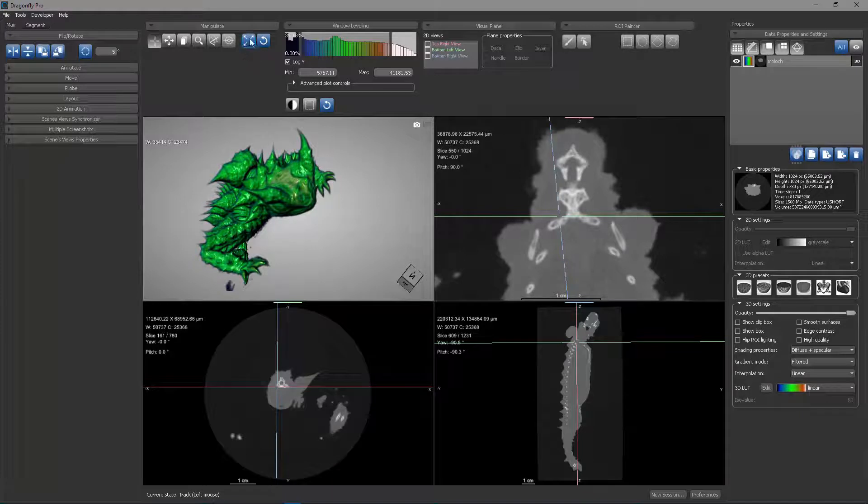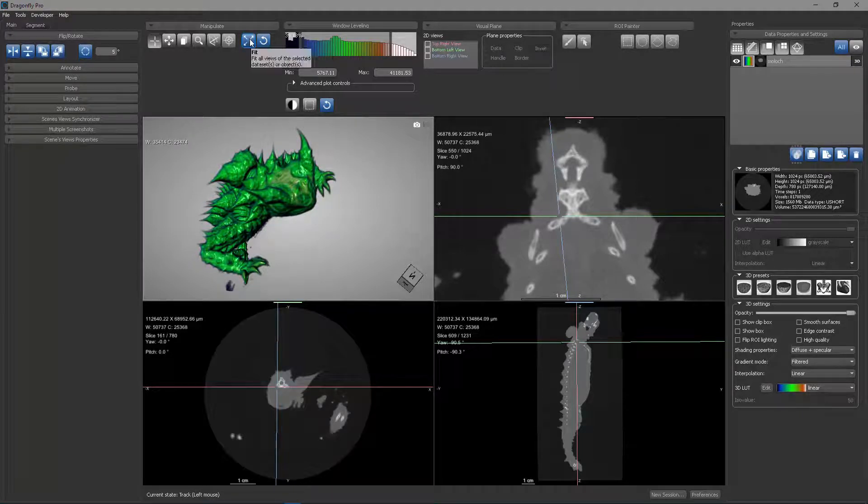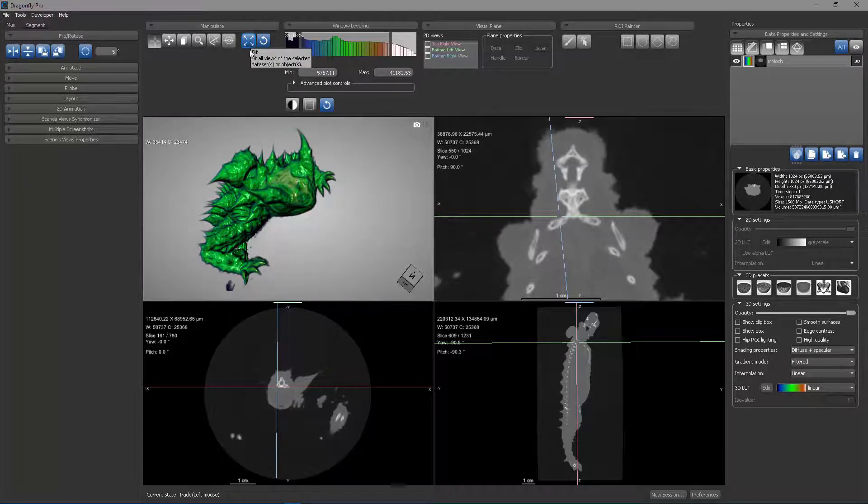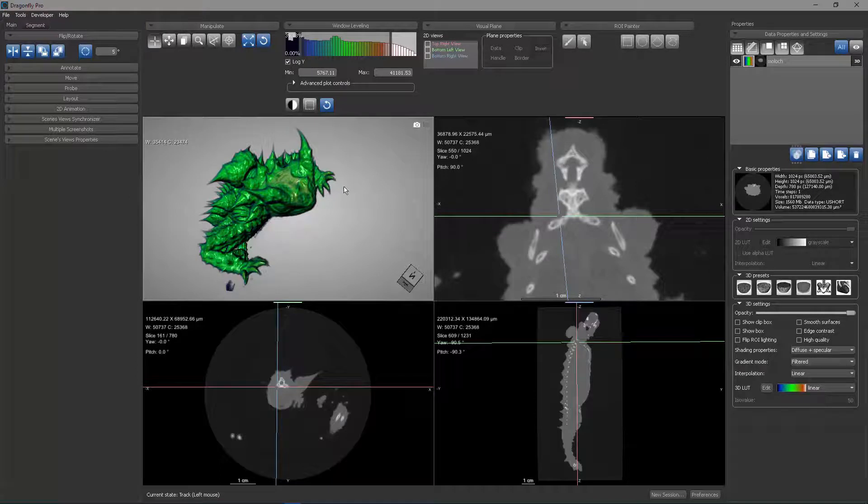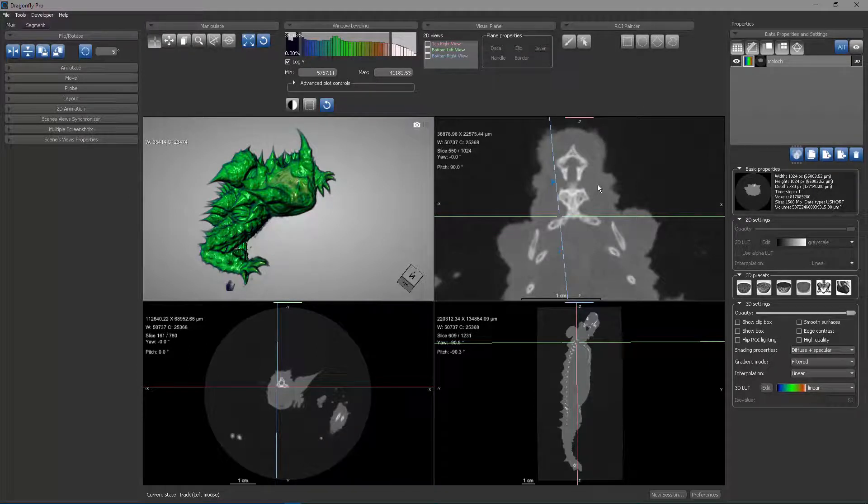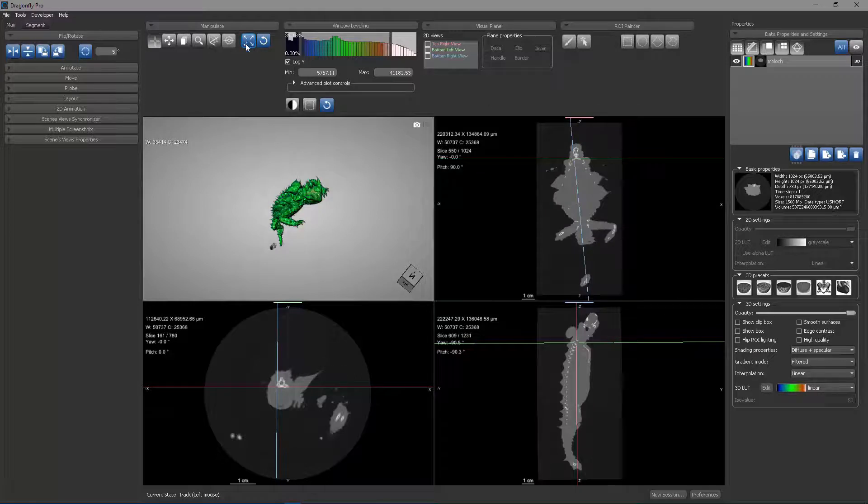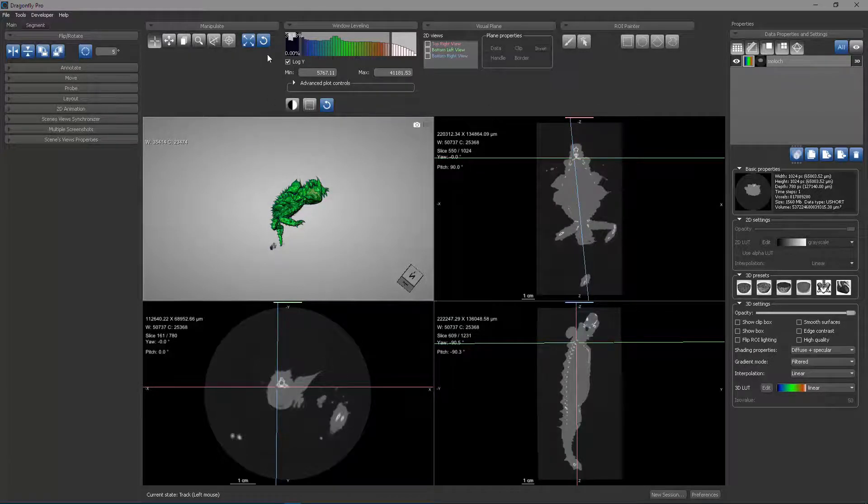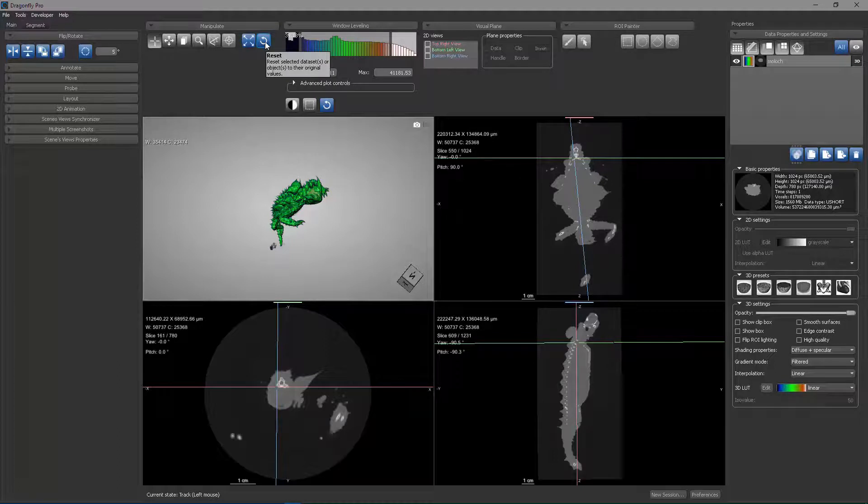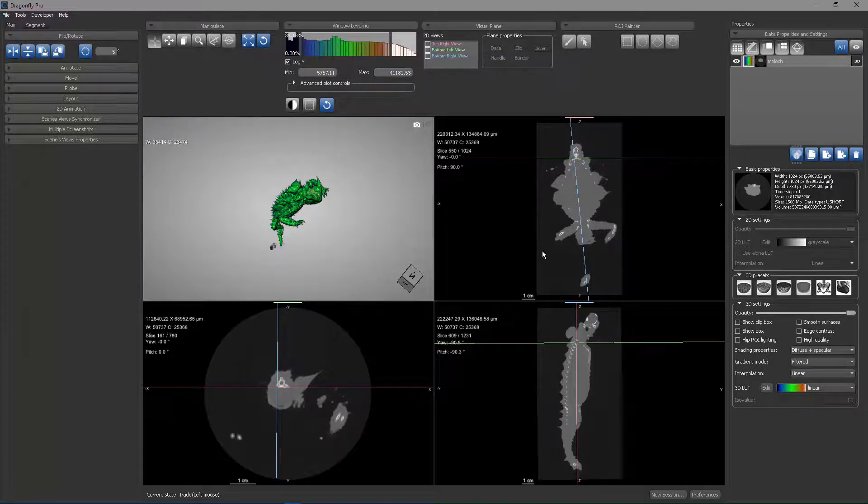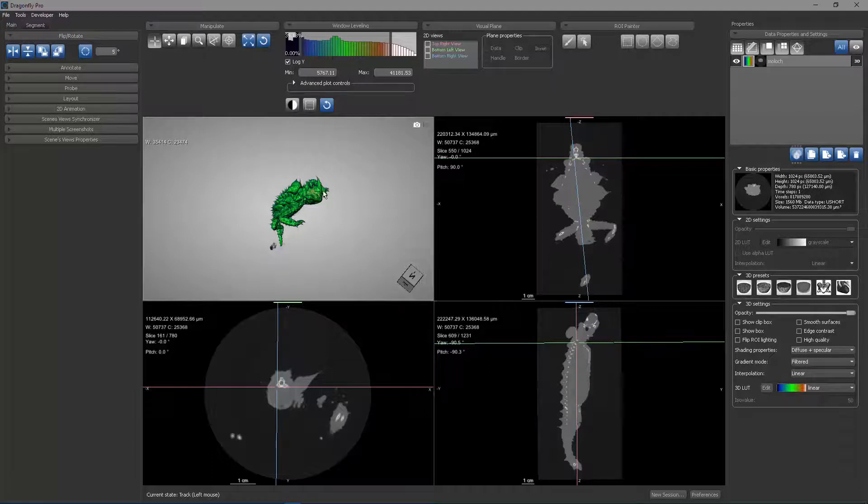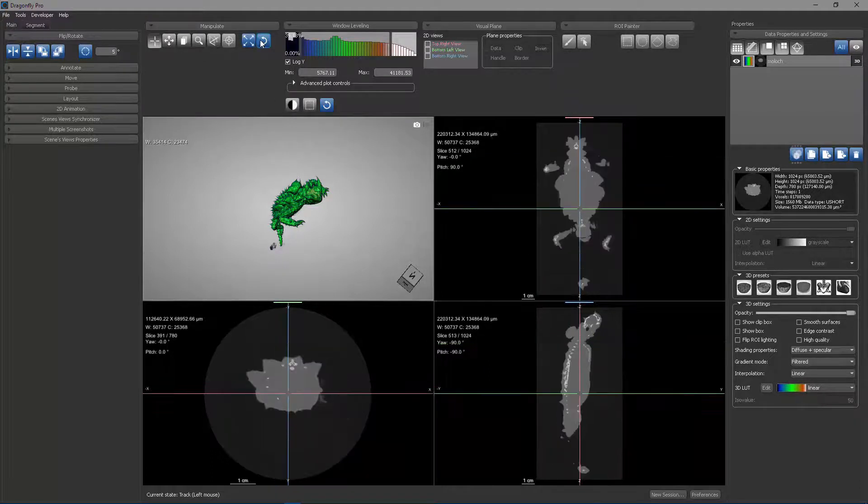If I click this button, this is an action button, and this will take all of my 3D and 2D views and zoom out or zoom in so that the data models that are loaded now fit within the view. You can see that now they all fit. The final action button is a reset button, which will reset all of the views to their initial orientation, and it will reset the zoom.